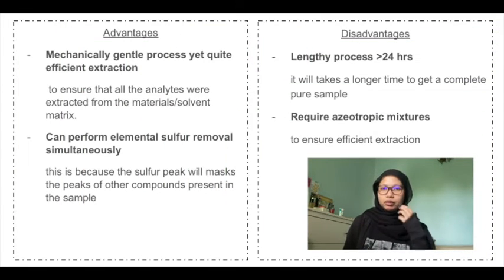Assalamualaikum. My name is Asma Najah binti Asrawadi, and I will explain to you the advantages and also the disadvantages of this extraction method. So as we all know, every method or every process has its own disadvantages and also advantages. So what are the advantages of this Soxhlet extraction method?